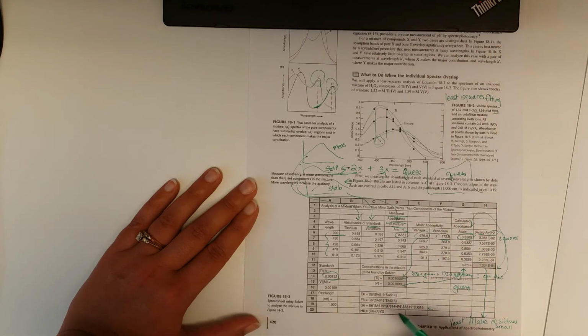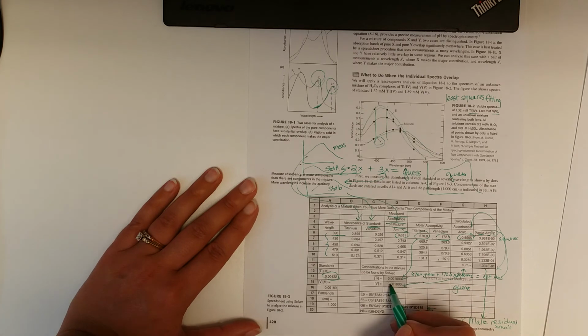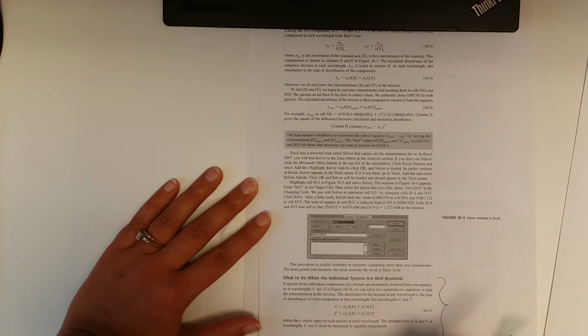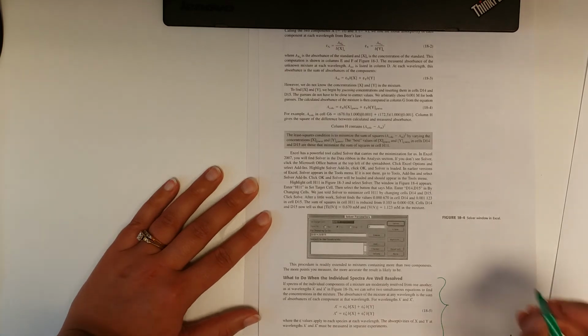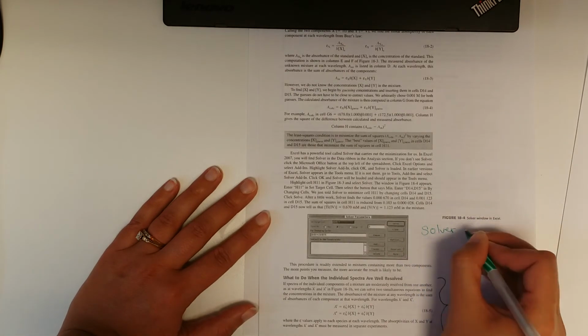And you can fiddle around with this. You can type in a number, see if the sum goes up, which is bad, or if it goes down. And then you can type in a number here. Does the sum go up, which is bad, or down, which is good? Or you can let Excel do that for you. Remember the data analysis stuff for our lab? We also have the so-called Solver plugin.